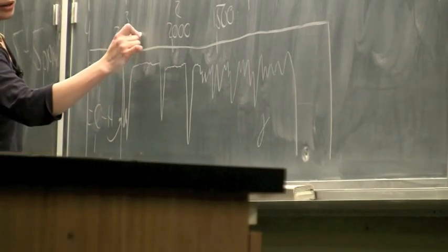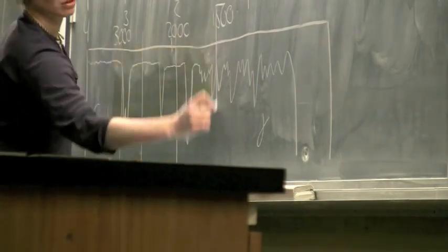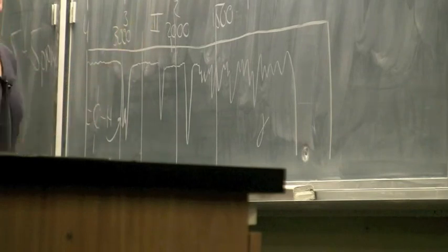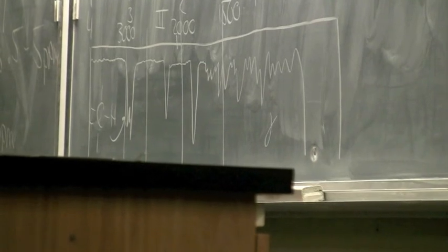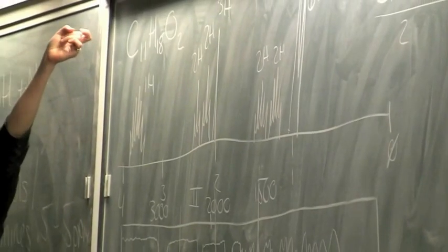If we keep going, we break this down into our zones, and say, well, there is something in zone 2. If there's something in zone 2, you have a triple bond. It's either an alkyne or a nitrile, C triple bond C, C triple bond N. They can be really hard to tell apart just from your IR. They've got almost identical ranges, but we have no nitrogen.